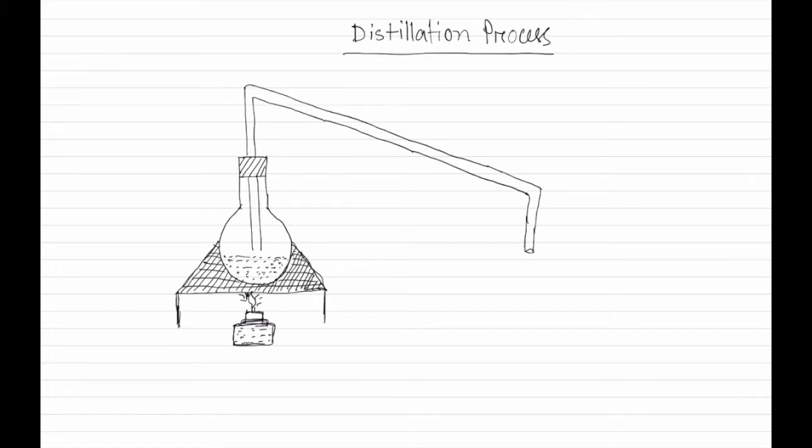And a flask, one whole flask set, or a beaker set in the other side of the distillation process. This beaker will receive the necessary liquid substance or gaseous substance also.